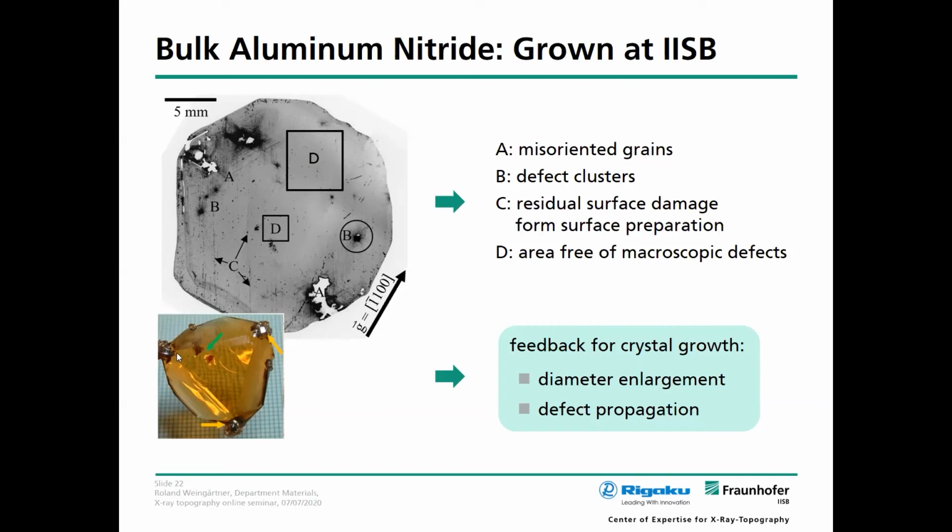And we grow this in-house. And of course, we use the XRTmicron tool also for characterization. Yeah, so here you see a typical example of such early results of our crystals.